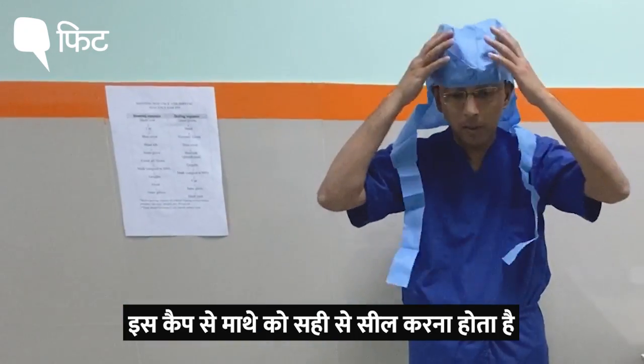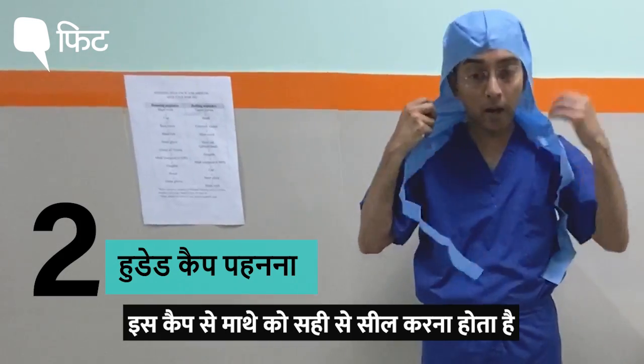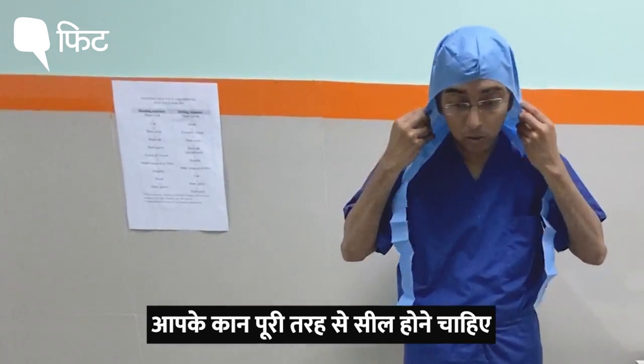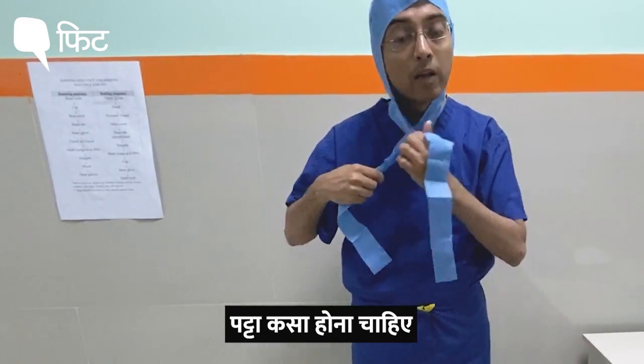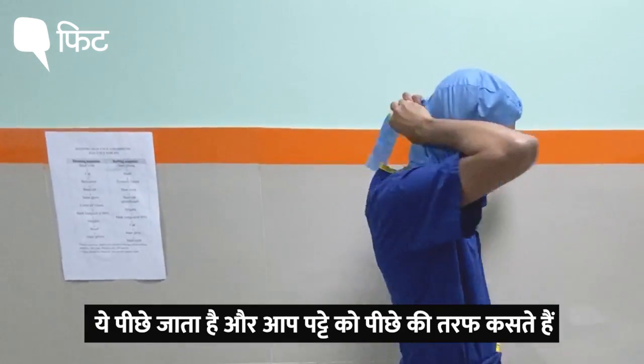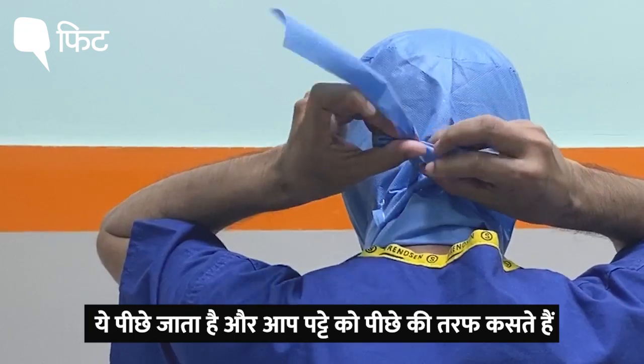So this cap is to be worn like this. It has to be sealed right on the forehead and your ears should be sealed completely, then this strap has to be tightened up — it goes back and you tighten up the strap on the back side.